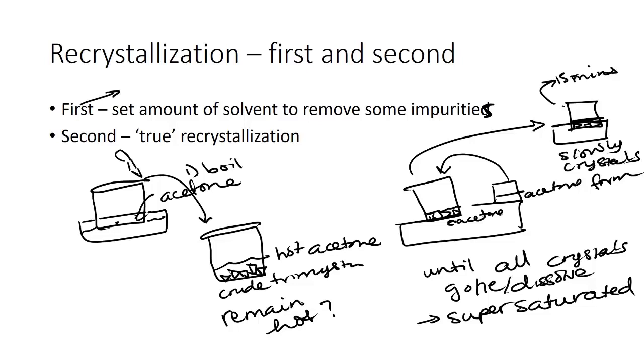Now, if you don't start seeing crystals form, let your professor know. They may have some techniques to help your crystals form, or you may have too much solvent. So then you put it in an ice bath to cool for maybe another 5 to 10 minutes.